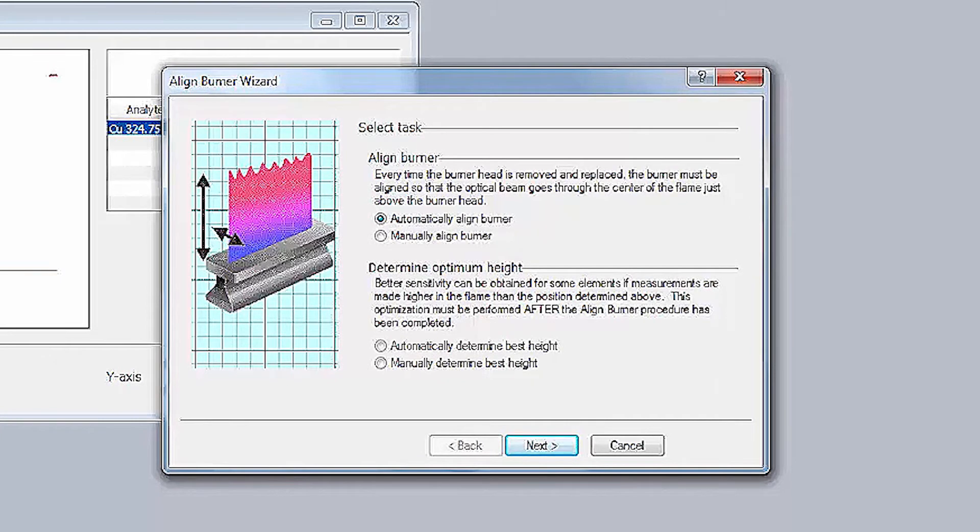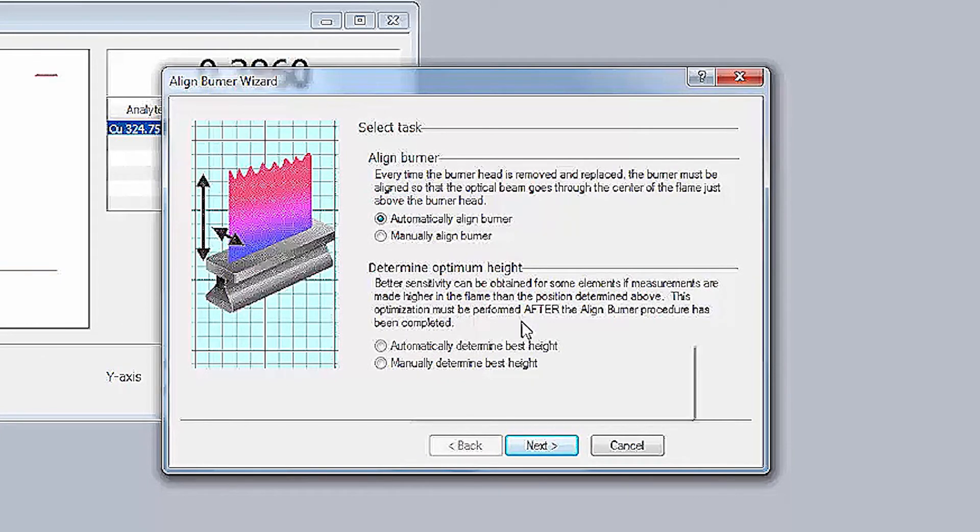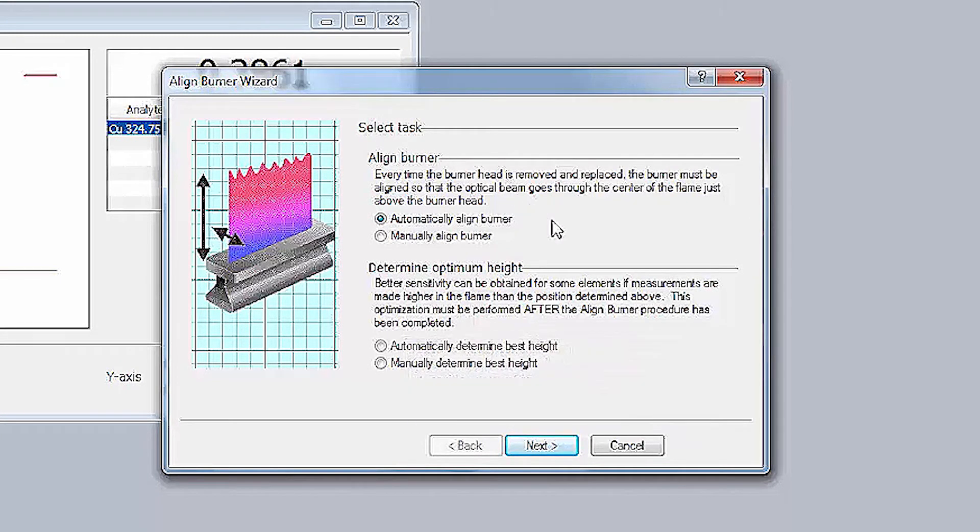The Align Burner wizard and continuous graphics will appear. This wizard will first guide you through the burner alignment and then, if desired, can determine the optimum burner height to view the flame. The Align Burner wizard will guide you through this optimization process.